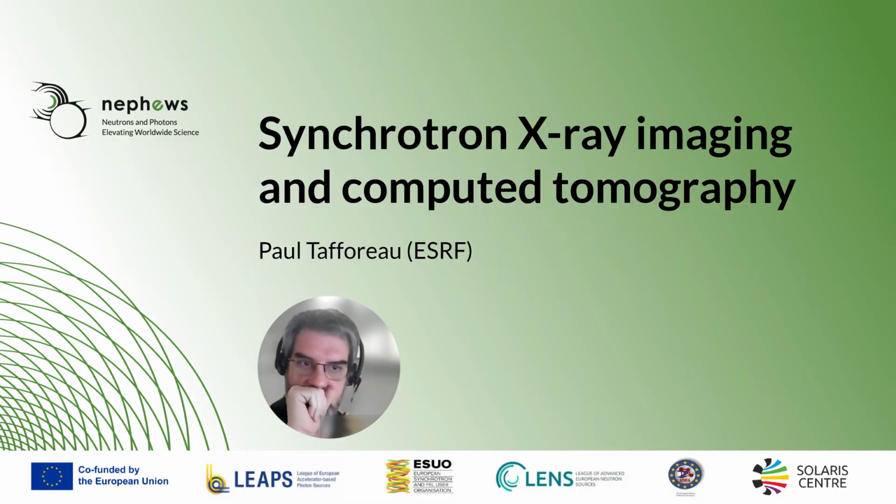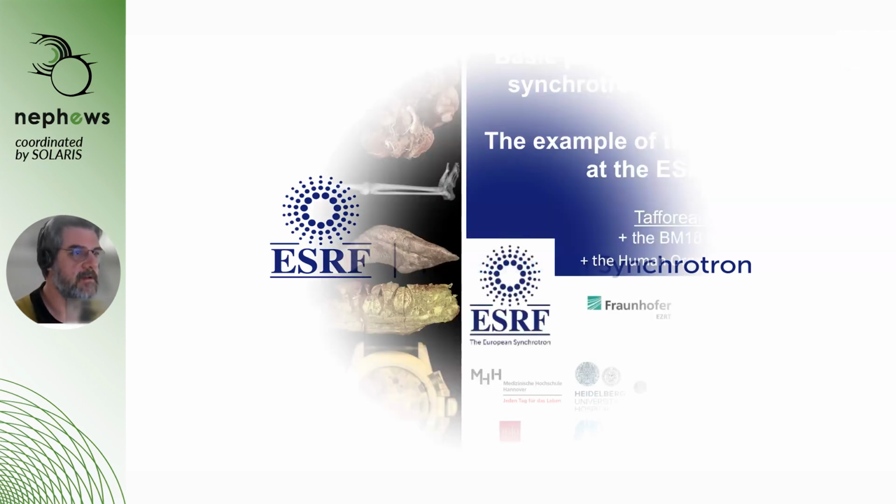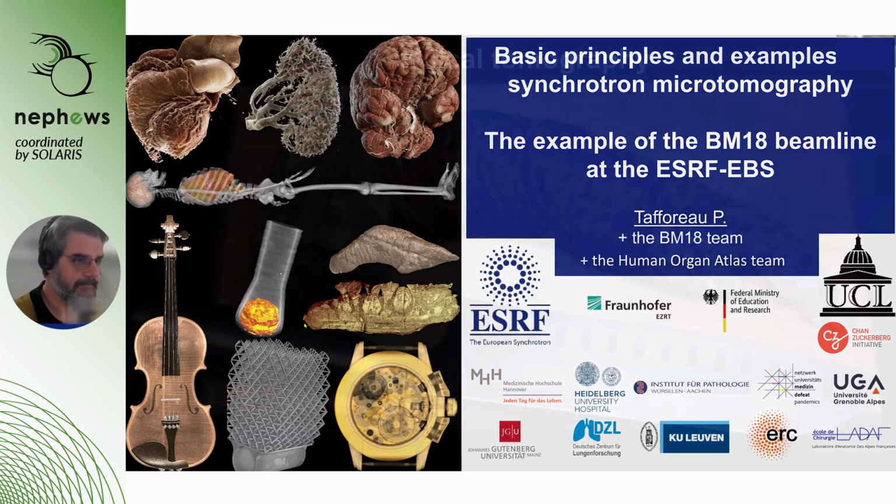Good morning, everybody. I will do an introduction of what we can do with synchrotron microtomography. It's not an exhaustive presentation because there are plenty of different variations of this technique, so I will focus on the most common one, that is the propagation phase contrast. And for that, I will use examples mostly from BM18, but not only.